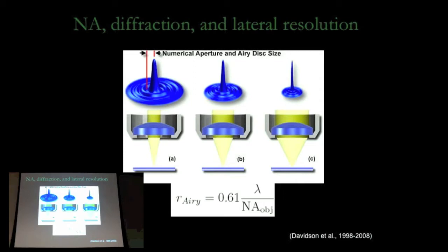I have a question about that, Andrew. If you had two objectives, one with a higher magnification, which you might a priori think is what you want, but it has a lower NA, would you actually potentially be better off using the next magnification down, knowing that you're going to collect more light? You would actually be able to resolve a signal.